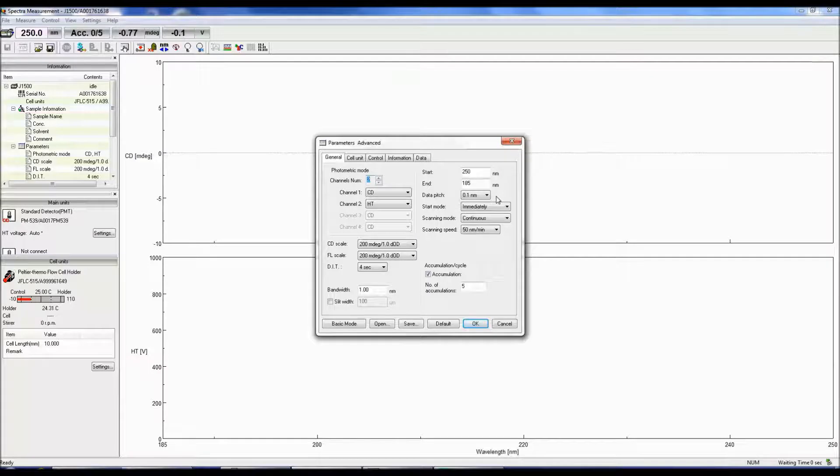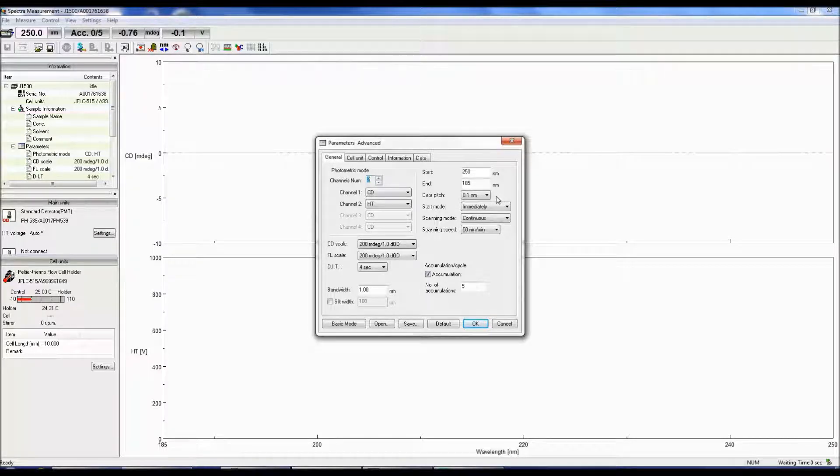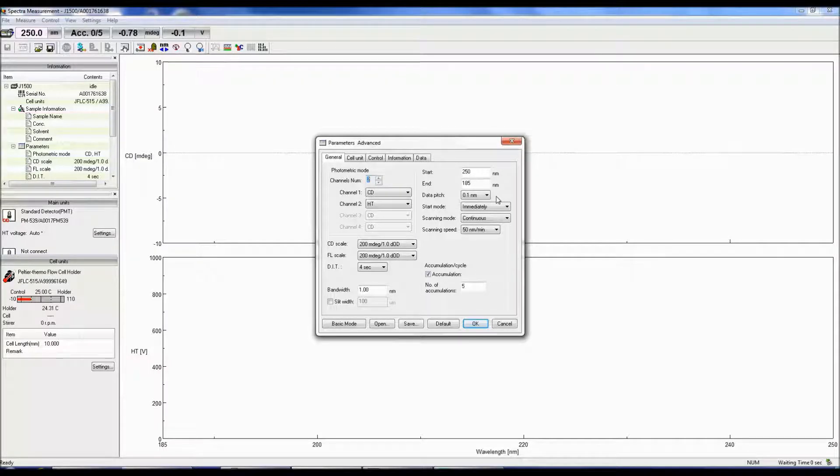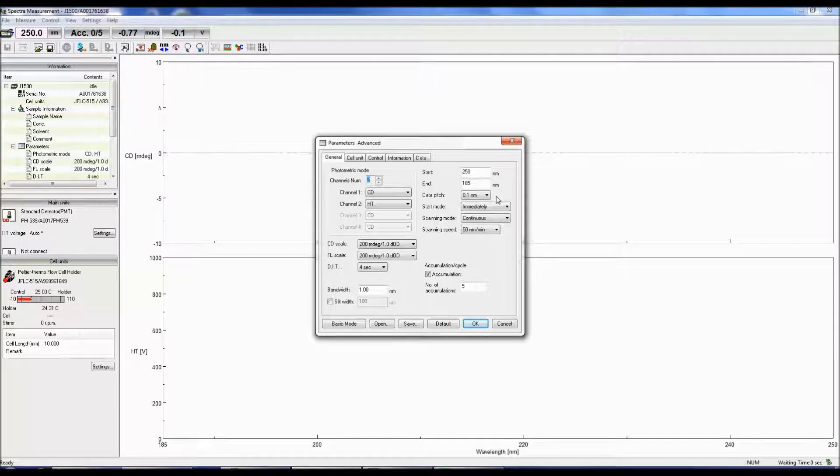Selecting too small of a data pitch and you might obtain a spectrum with a lot of noise, but too large of a data pitch and crucial data points could be missed.